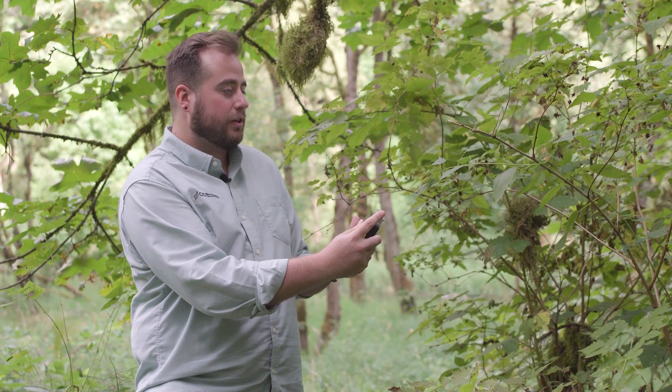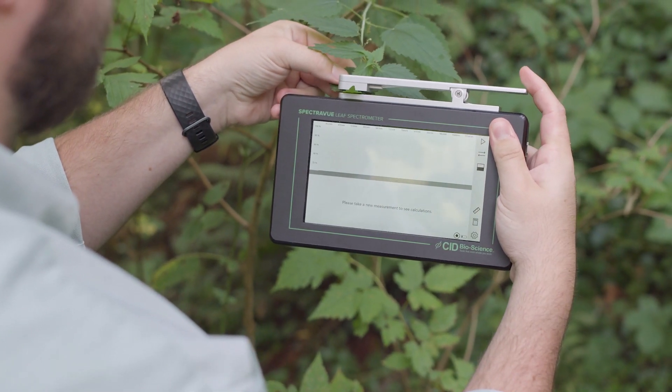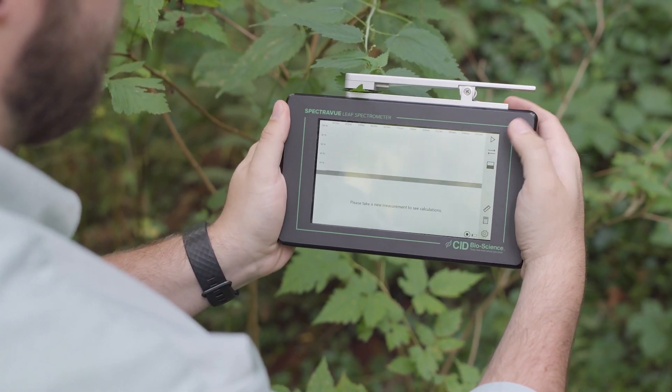We're going to start by measuring this tree here, and I'm going to take a measurement of a healthy leaf, and then I'll follow it up with a measurement of an unhealthy leaf.